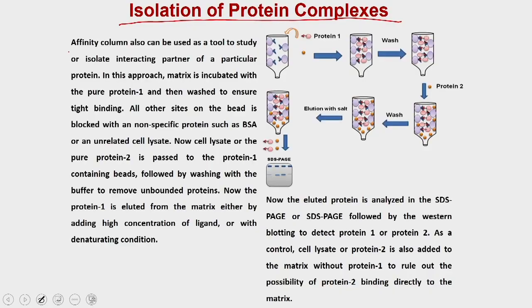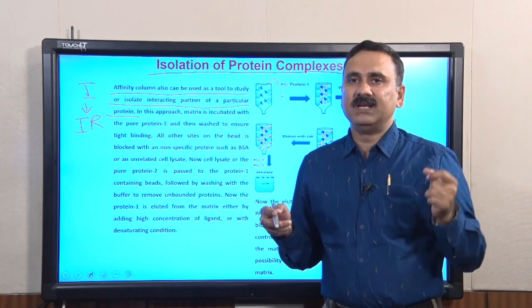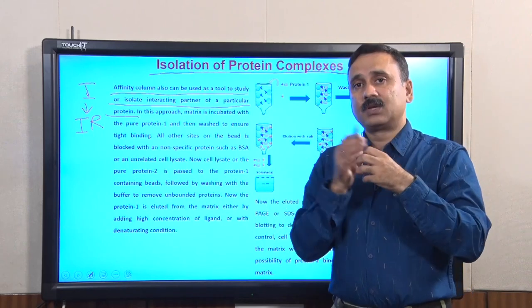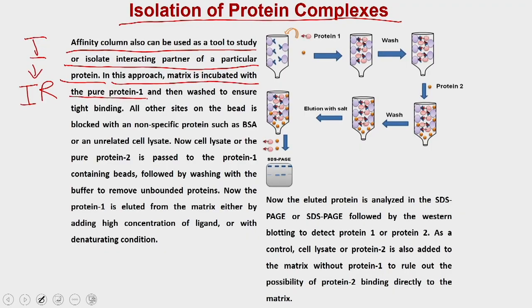Affinity chromatography can be used to study or isolate the interacting partners of a particular protein, which means in this problem you are going to have one protein which has the affinity for the matrix. In this case, this protein is the insulin receptor, because we are stimulating with insulin. So our protein number 1 is the insulin receptor. You put some kind of affinity tag on it, for example a histidine tag or a GST tag, so that it has exclusive affinity for the beads. The matrix is incubated with protein number 1, the insulin receptor, and then you wash to ensure tight binding, which means the beads have the insulin receptor present on their surface.